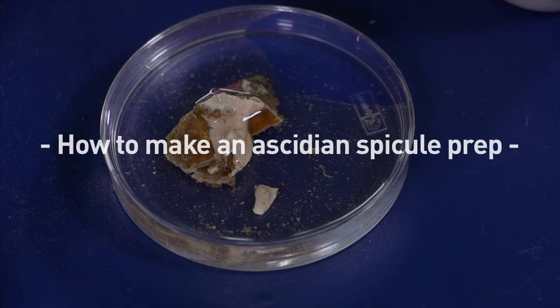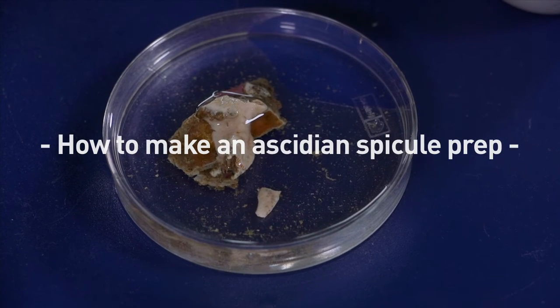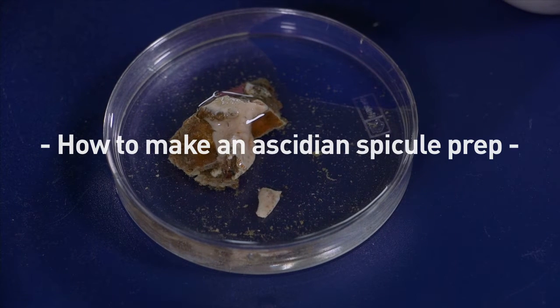Samacidians produce calcareous spicules that accumulate in their tunic or internal tissues. While not all species have unique spicules, they still have taxonomic value and help to discriminate among species. The spicules are very tiny, usually between 15 and 100 microns, so we have to prepare them to be studied in a scanning electronic microscope.